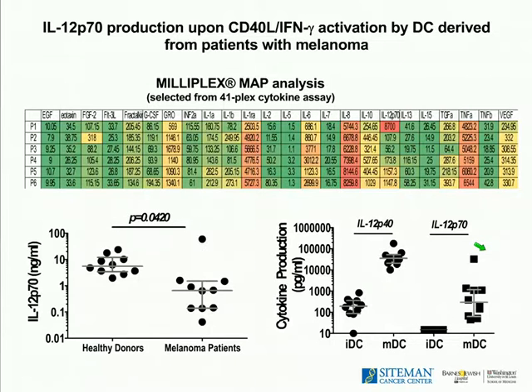In contrast, when you look at IL-12 P70, only the patients that were clinical responders, that is P1, P5, and P6, were able to make IL-12 P70. So these data then said to us that the defect was specific to IL-12. It was probably pathway specific also. So then we wanted to look further into which of the two components of IL-12 was defective in the patients that had no clinical response.